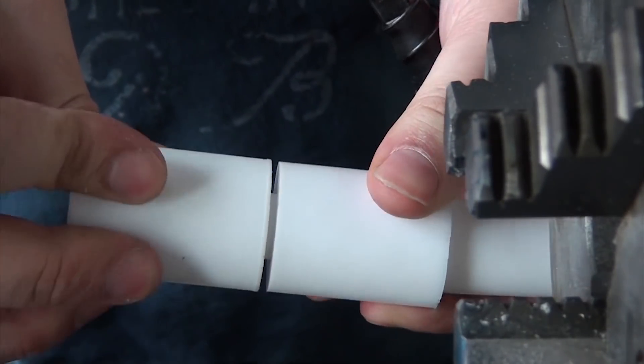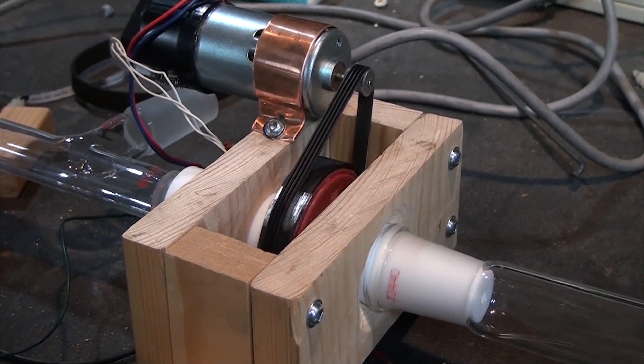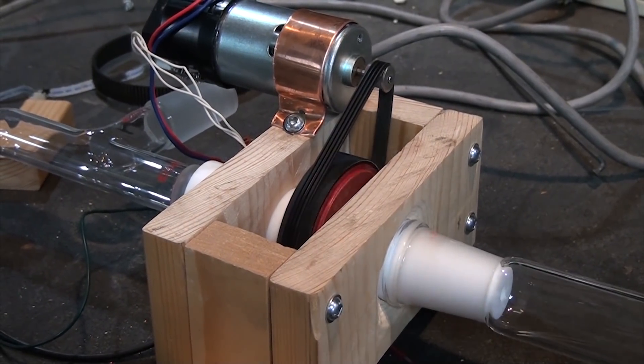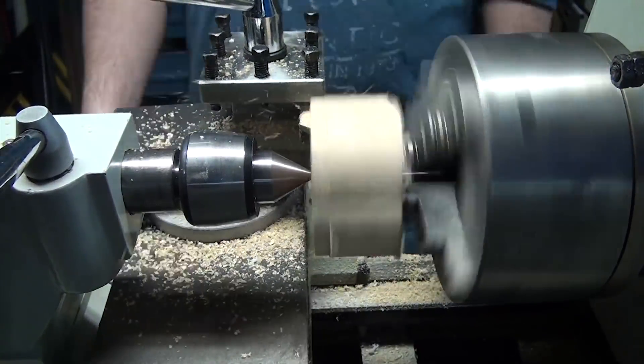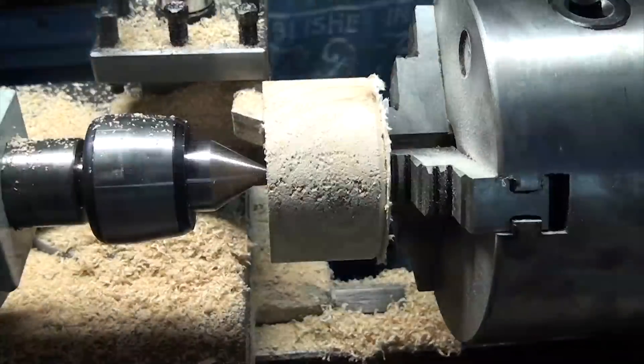With the coupling done, we can now focus on motorizing this. This was a fairly simple task. We didn't have the right gears around the lab, but I found some gear belts that meshed together, so I decided to make a gear out of the larger gear belt and some wood. I turned a cylinder out of a piece of spruce 2x8 I found lying around, using a mandrel made of a random steel rod and some tail support.